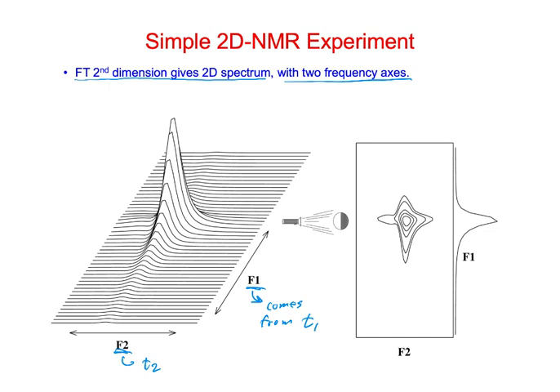All right, so T2, remember, this was the acquisition time, and T1 was the increments. Right? But as in one-dimensional, there's actually two-dimensional, so this is two-dimensional because there's two axes, there's two time delays or time increments, but we have the intensity as well.